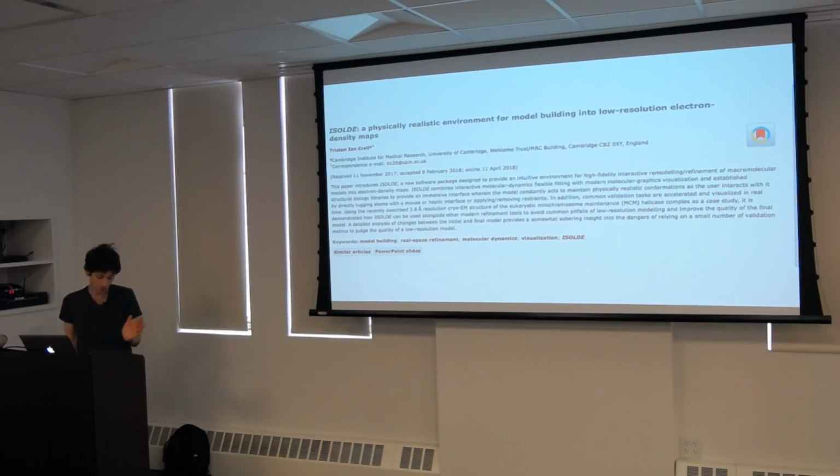And this certainly seems to have given some good results for a couple of tricky cases, notably one of the insulin receptor structures was very much helped by this. As I say, I haven't tried this, but give it a go because it looks really cool and really interesting. And certainly some approach like this is going to have to be the future, something that is taking into account geometric considerations of all the atoms that you're dealing with.